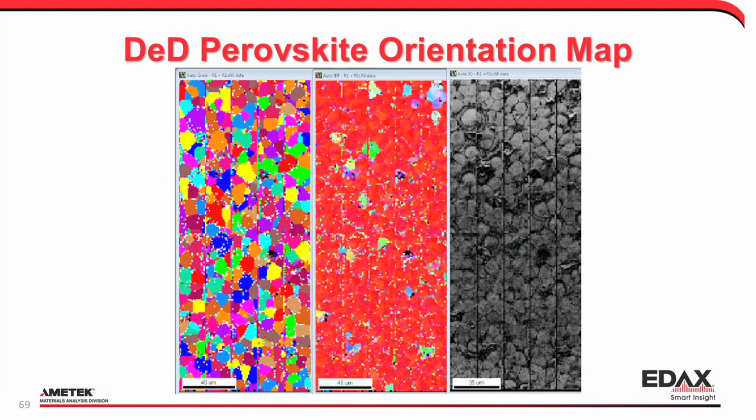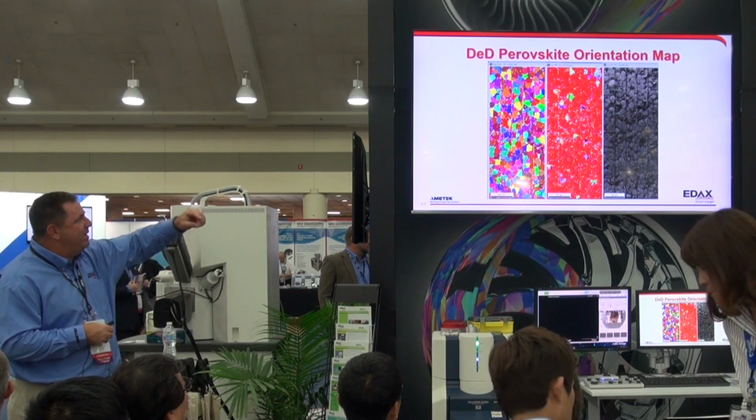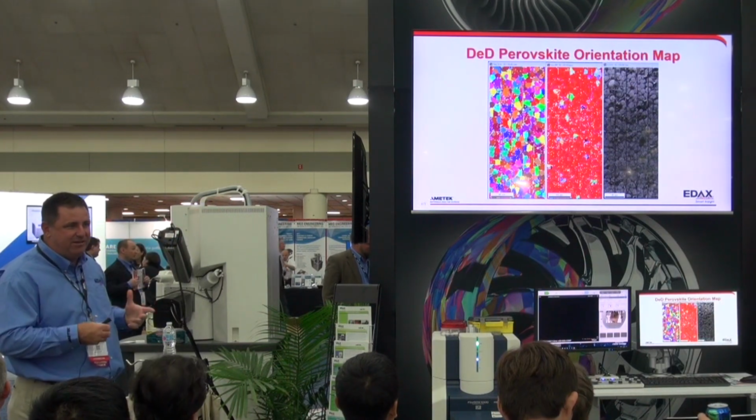This is on a perovskite photovoltaic film, where there are beam sensitive samples that can't handle the typical beam currents used for traditional sensors, but you can run at lower beam doses and still get a diffraction pattern and not basically melt your crystal.